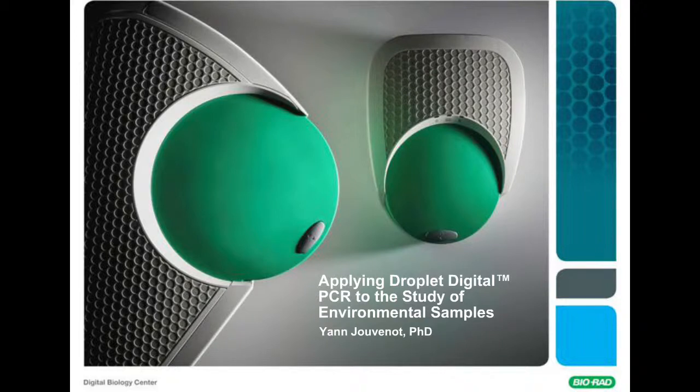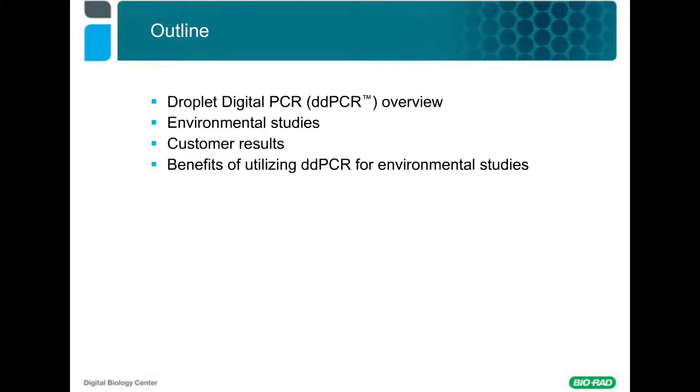Yann? Thanks a lot for your introduction, Mohini. As we said, we will discuss today several possible applications of Droplet Digital PCR to environmental studies. First of all, I would like to have a brief introduction on the ddPCR platform, the QX200, for those of you who might be unfamiliar with it, as well as the principles behind digital PCR and its unique characteristics.